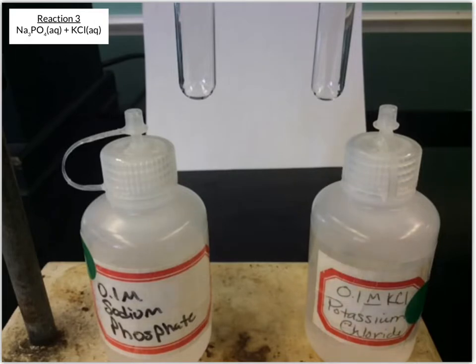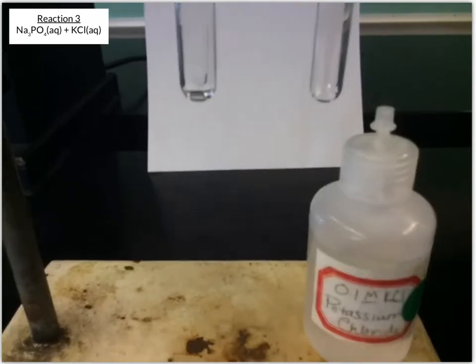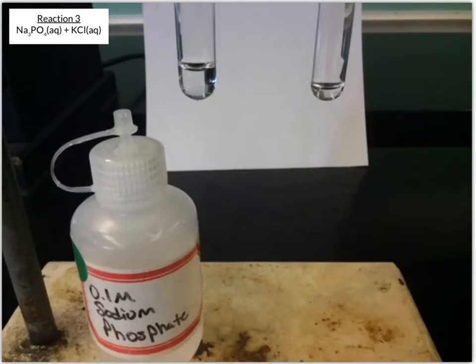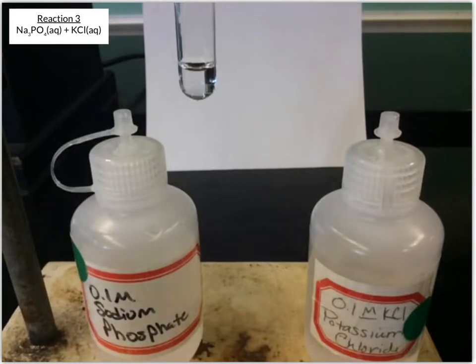Now for the third reaction, we're going to react sodium phosphate with potassium chloride. And again, I'm going to put about 1 milliliter in each of these test tubes to start with. And if you look at those, you see that those are both clear colorless solutions to start with. And so I'm going to take the potassium chloride solution and pour that into the sodium phosphate solution.